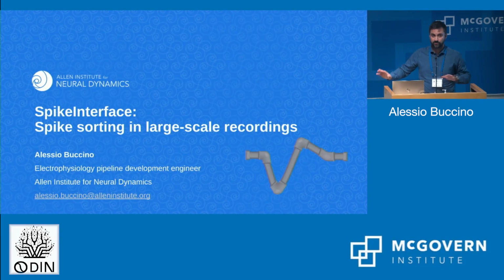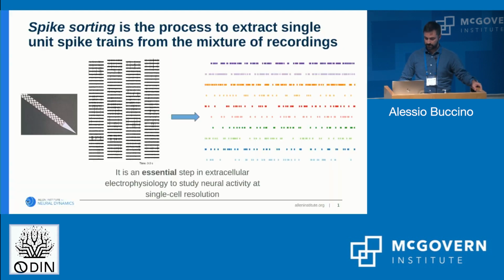Actually, it's mainly going to be about SpikeInterface. I have a couple of slides on SpikeForest as well, but mainly SpikeInterface. This is going to first introduce SpikeInterface, how the project started, and what we try to solve. And in the second part, I'm going to show you some more recent advancements that we are doing in order to make SpikeInterface more standardized tools for electrophysiology analysis.